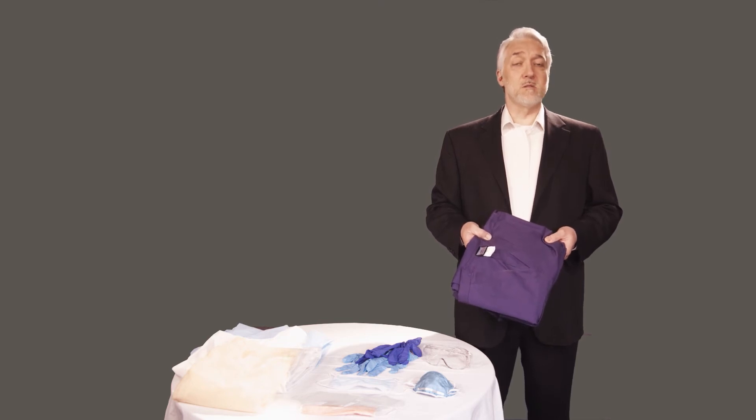The rest of PPE is made up of protective body clothing. Scrubs, gowns, aprons, and shoe covers provide a protective layer over your workwear. Your workwear may consist of items that could, in some cases, be considered PPE.